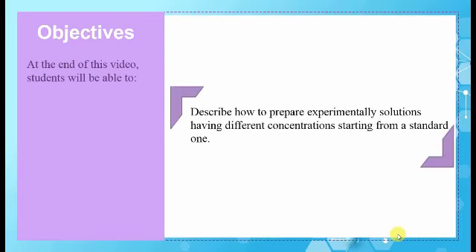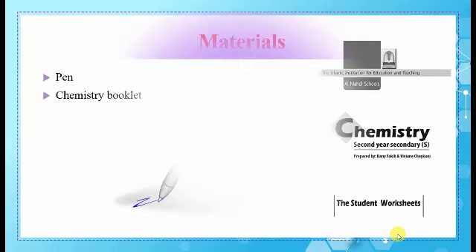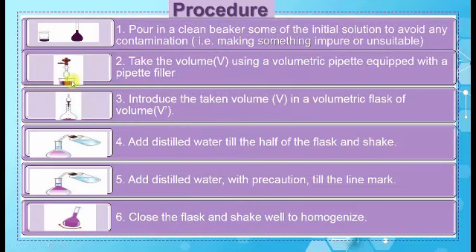At the end of this video, you will be able to describe how to prepare experimentally solutions having different concentrations starting from a standard one. Please prepare your pen and your chemistry booklet. Now, let's read together the steps that must be followed to prepare this solution.